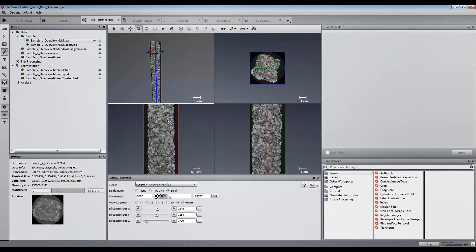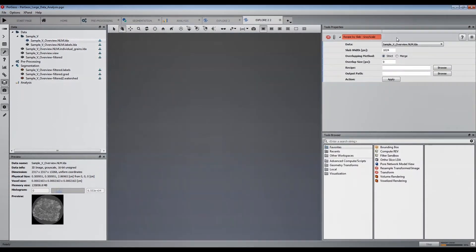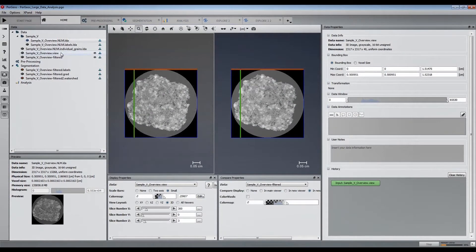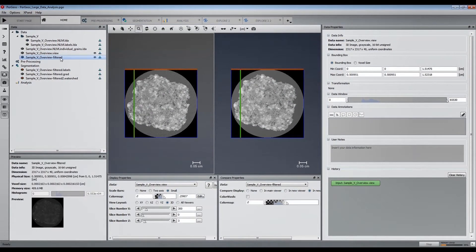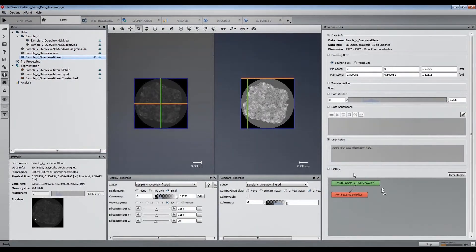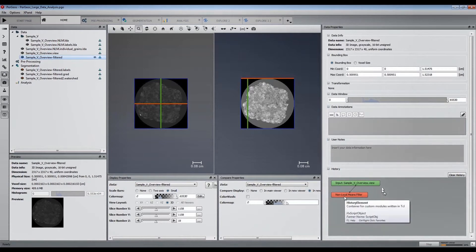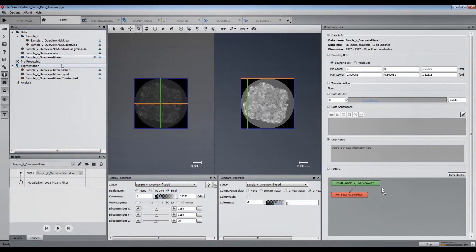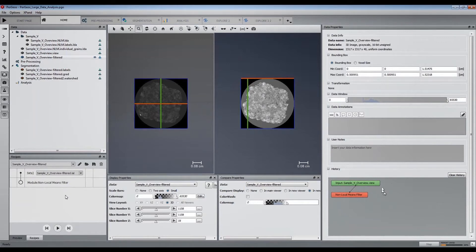We are looking here at the denoised sandstone sample. In order to apply the non-local means filter on the whole data, we have used a slab processing module that is available in the Explorer workspace. In order to run the module, we have extracted a sub-volume and created a simple recipe containing the non-local means filter, as you can see in the history window of the sub-volume.